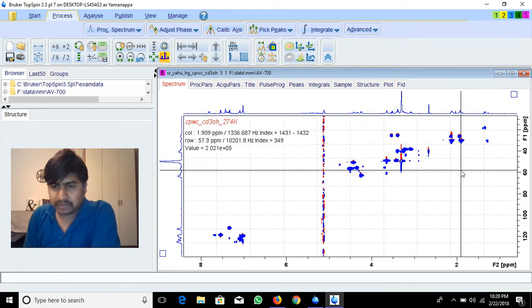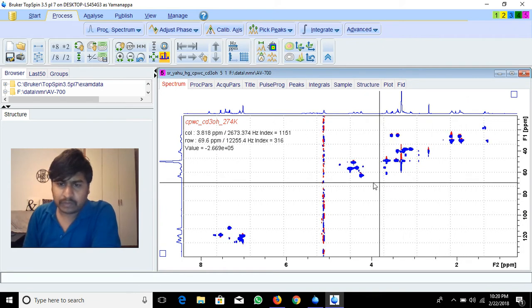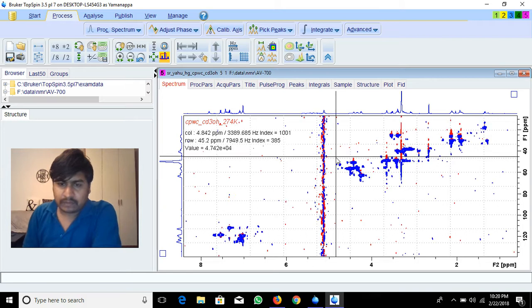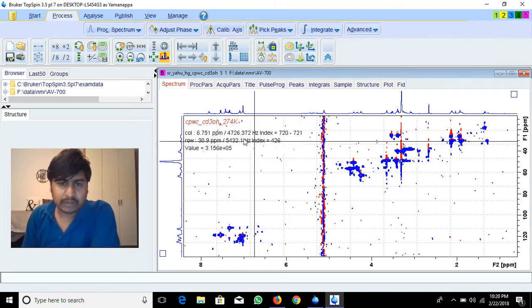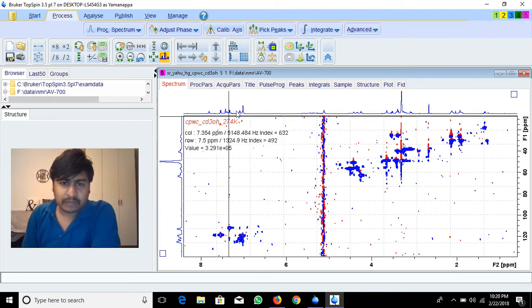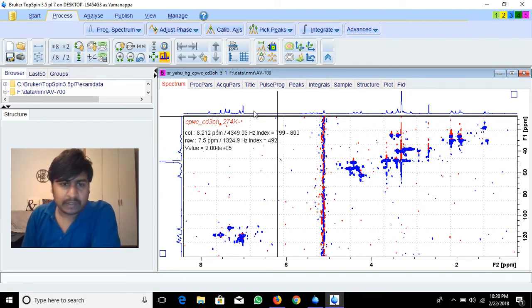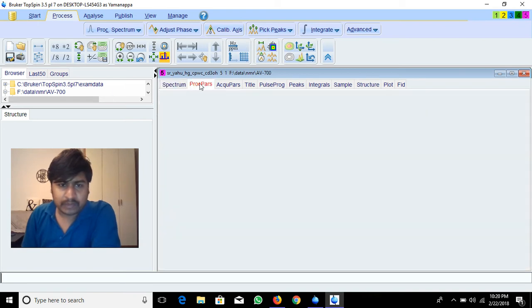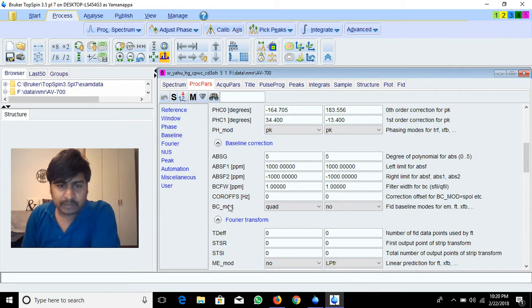If you want to suppress this offset peak without re-doing the experiment, you can suppress it in processing. For that you have to change some processing parameters. In the Process menu, there is the BC mode option — it's a fit baseline mode for em ft or xfb.